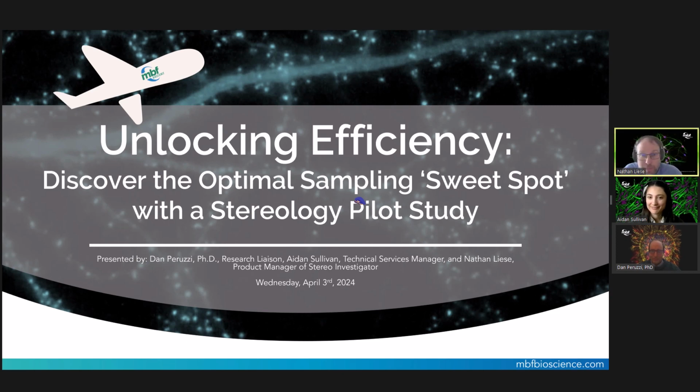Hello and welcome. We're excited to talk with you today about what for some can be the hardest part of a project, getting started. That's right, we're talking about pilot studies. How do we unlock efficiency and find the optimal sampling sweet spot for stereology studies?